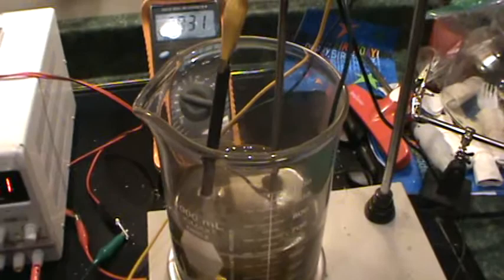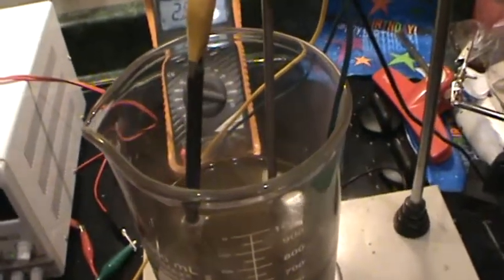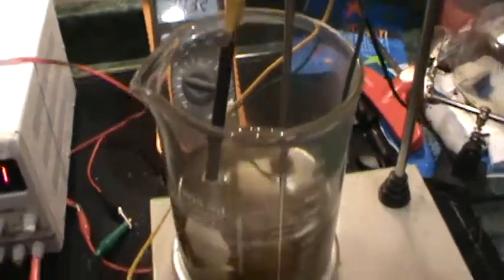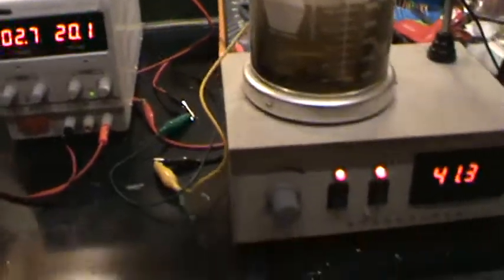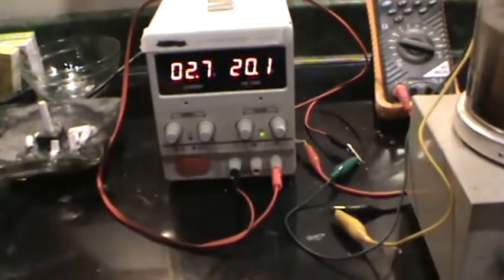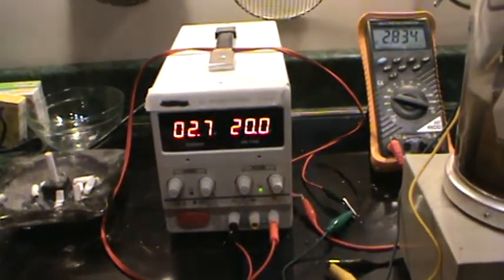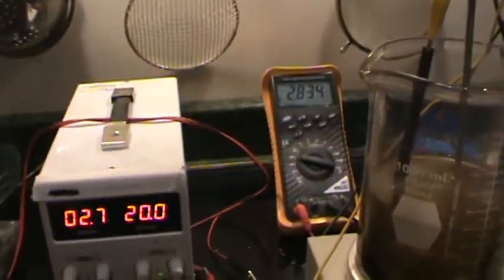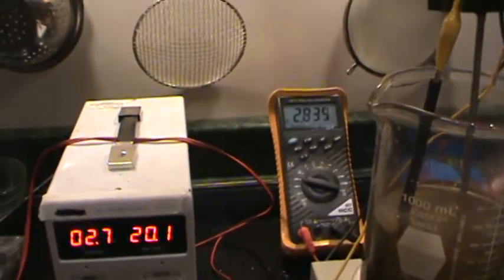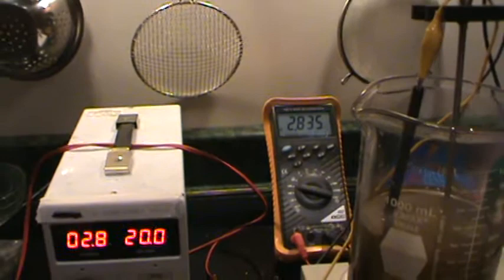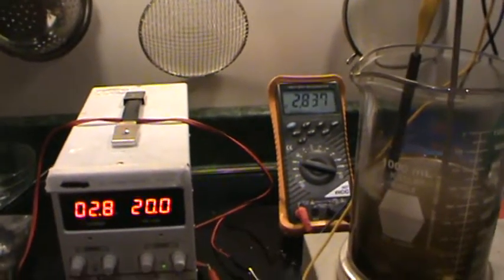I'm using a carbon rod for the positive. I've got it up to 20 volts DC. It's drawing 2.835 amps and it seems to be increasing.